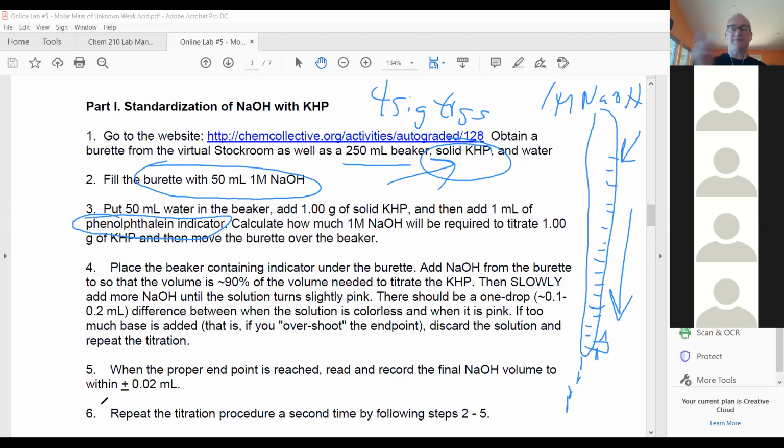More base, right. So it's acidic at the beginning because even though I have a weak acid in there, it's still an acid. So the pH is going to be less than 7. Actually, we'll be able to see because when we put it in the beaker, we can click on it and see what the pH is. You can actually follow the pH as you do the titration. So yeah, the pH will be low, between 3 and 4, I think, something around there.